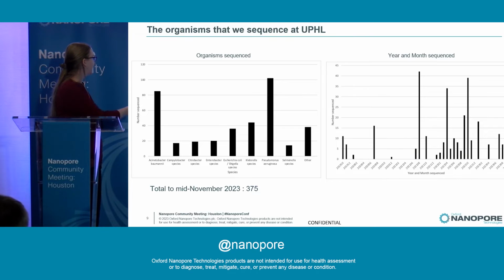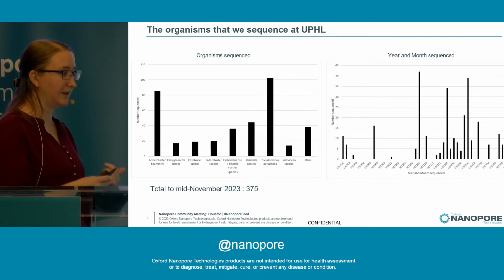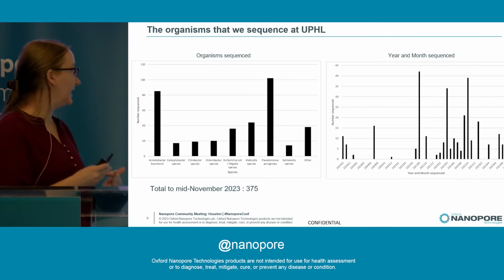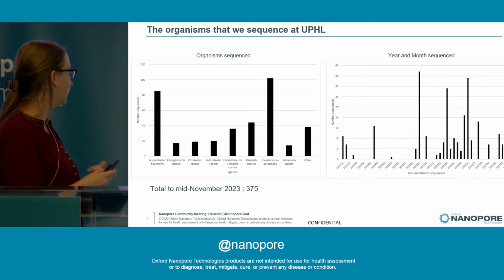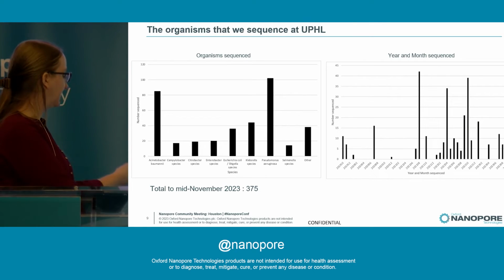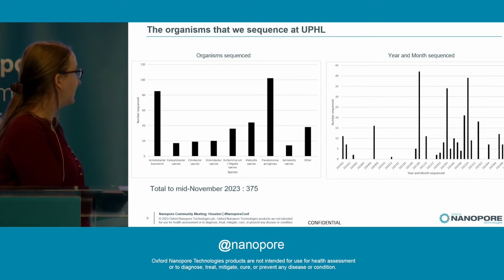We've sequenced a variety of organisms. Most of these are antimicrobial resistant. Things that I refer to long-read sequencing are those that have an incomplete AMR gene, or an OXA gene that hasn't been classified, or other AMR gene that hasn't been classified, or if a suspected organism is part of an outbreak. So these are not necessarily surveillance activities. There is a bit of a bias in what organisms are long-read sequenced, but we do have a variety of different organisms that we've sequenced.